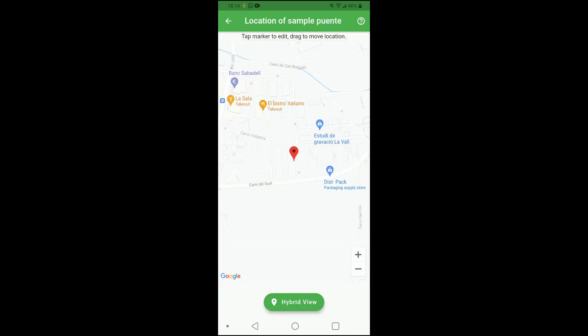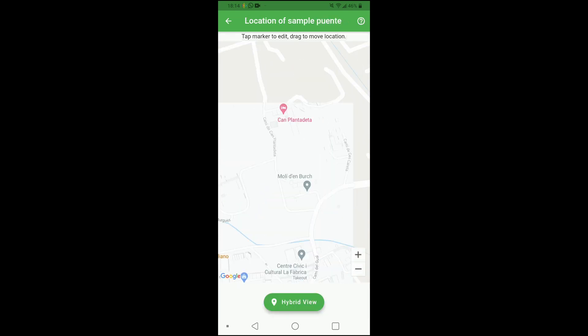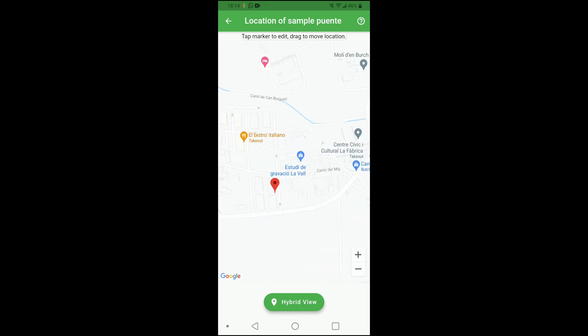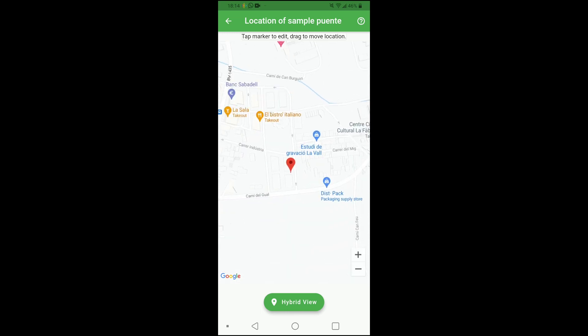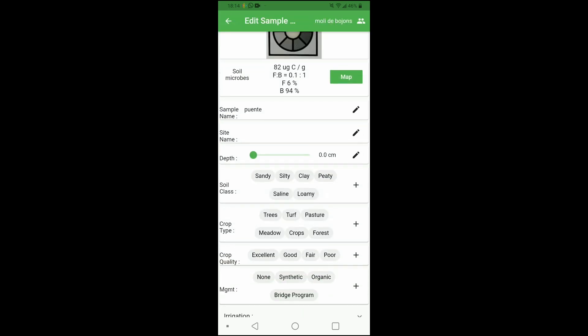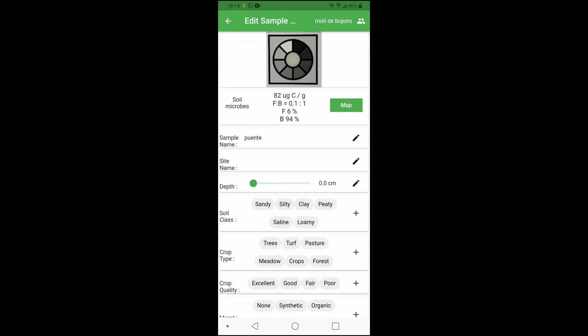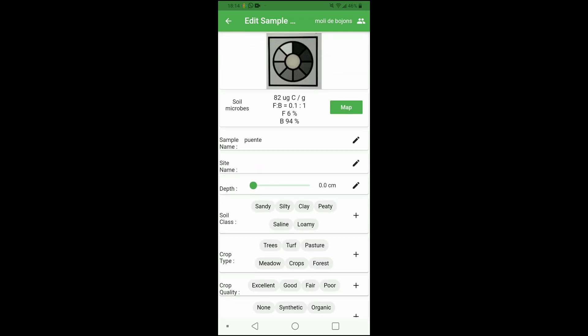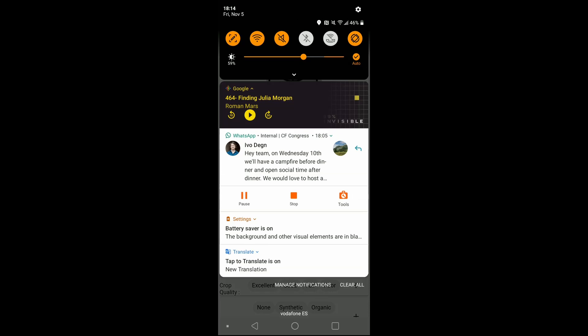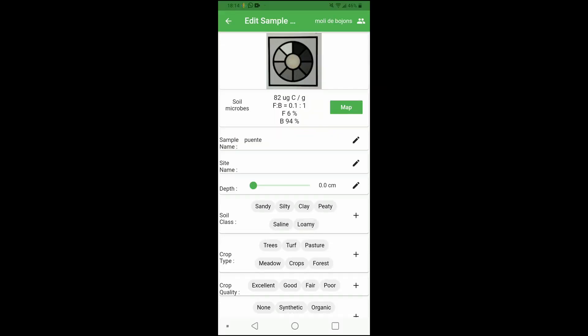In the map, you can even choose exactly where you took those tests. This part is useful to do out in the field, but I kind of prefer to bring the soil samples back home — it's just up to you. I have personally had some trouble saving the results after putting in all of this information, so instead I've just been taking screenshots just in case it doesn't save the first time.